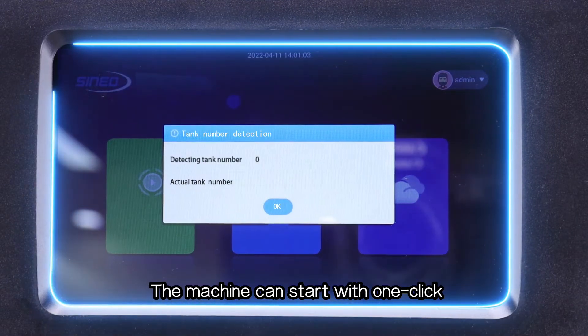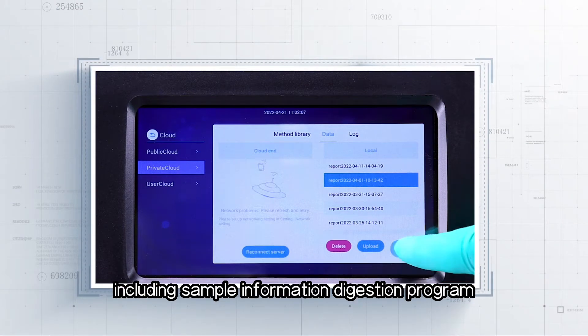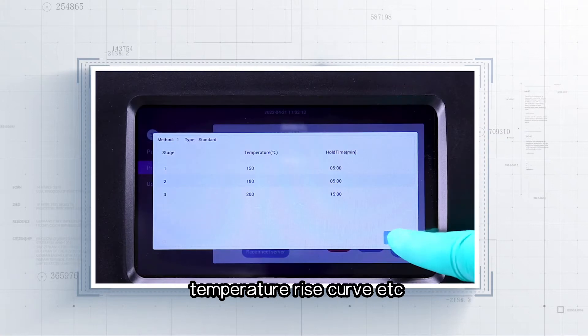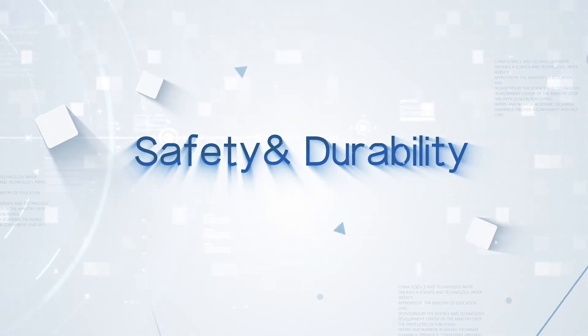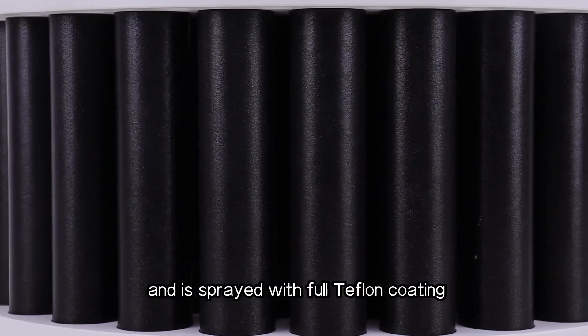The machine can start with one click. More than 100,000 operation logs can be stored, including sample information, digestion program, and temperature rise curve, making data storage and backtracking reliable.